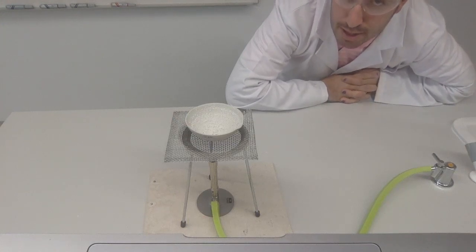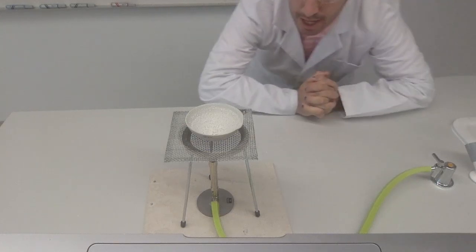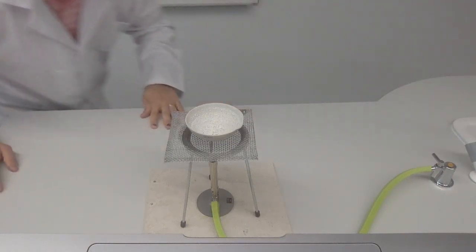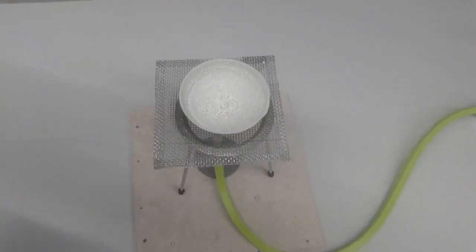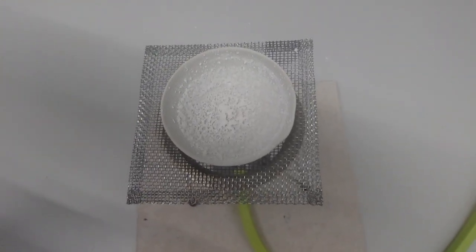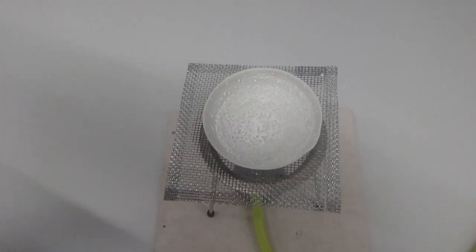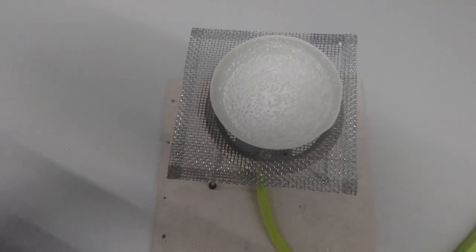So what we're going to do now is bring you a little bit closer into this wonderful world of crystallization, and you can see what was in that solution we had at the beginning. So let's see what we've got. Bring it closer. Wow, so many crystals, isn't it? If I'm not mistaken, I think those are salt crystals. So what we've got here is salt that has been separated out of our original salt water solution.